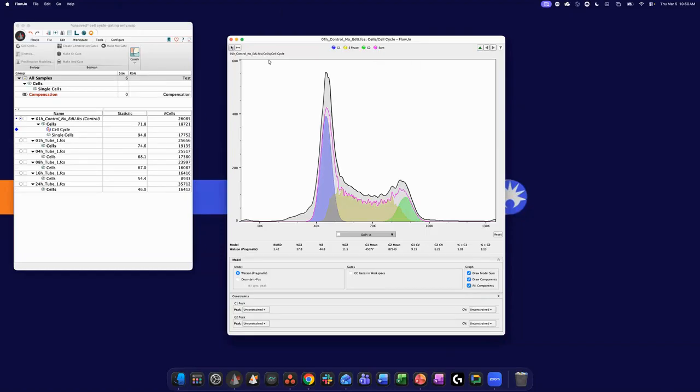So what happens by default? Okay, so by default, when you launch the module, it'll be defaulted to the Watson pragmatic model. Okay, so that's the one that does more of the kind of linear probability for the S phase. Okay. The model will auto fit, right, when it is in the unconstrained version. Okay, so it'll be unconstrained to start, and it'll basically just follow those assumptions we talked about on the slide, right?